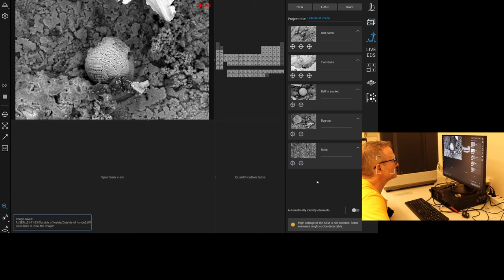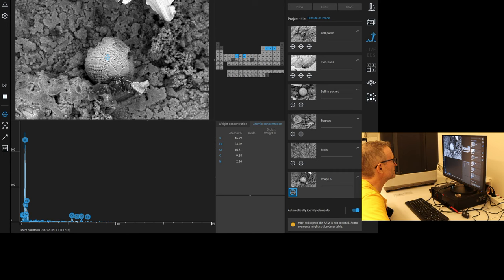Right. You have one on there, and I think it's iron. Does it move? Don't know. And we have another one on this material. Is that carbon rich? So, as I was saying, when it looks like this, it looks like it has got some chromium in there. So it's from the steel, I would imagine.